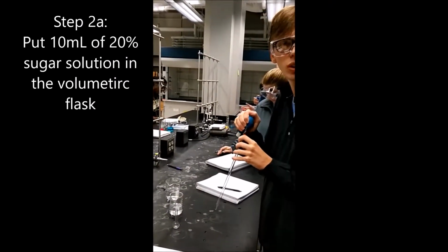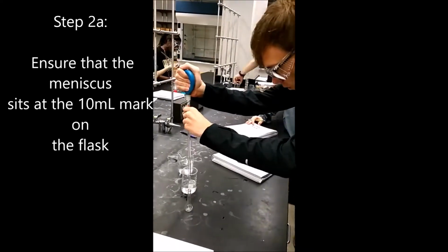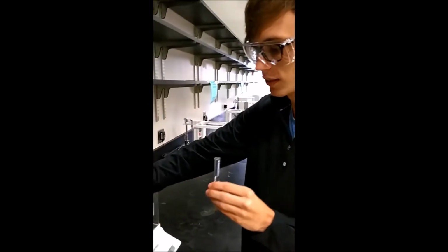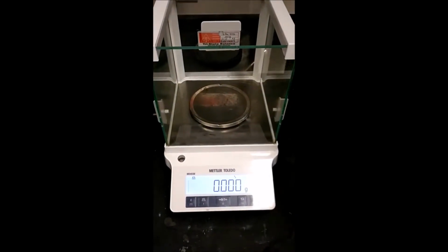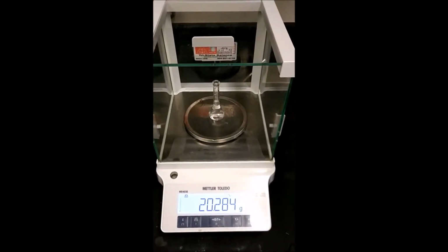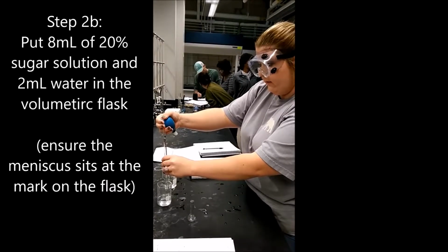Obtain 10 milliliters of 20% solution and put it in the volumetric flask. Now weigh the flask with 10 milliliters of the 20% sugar solution.